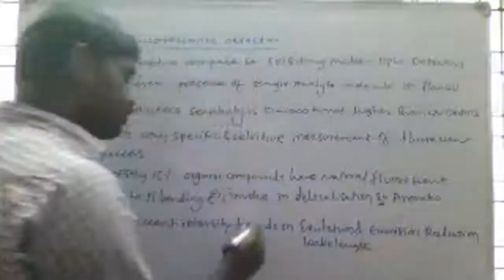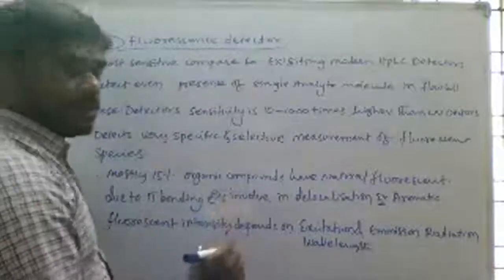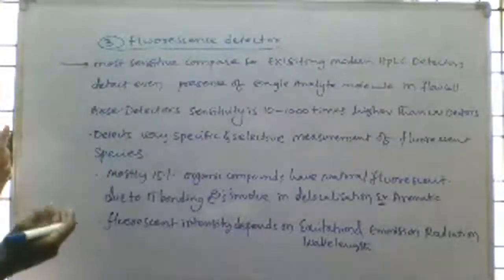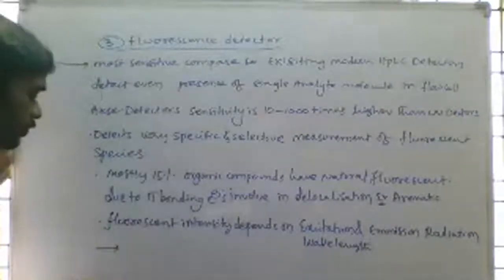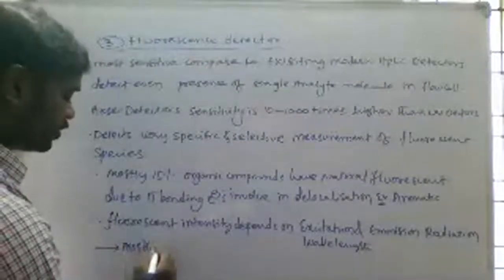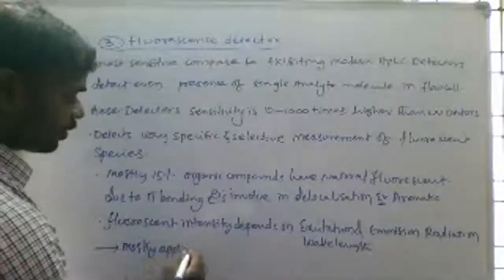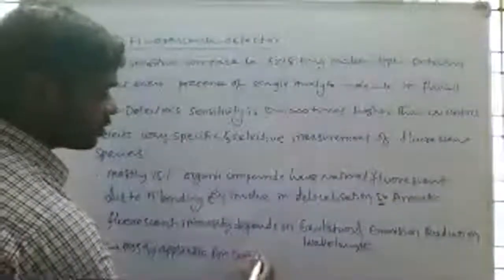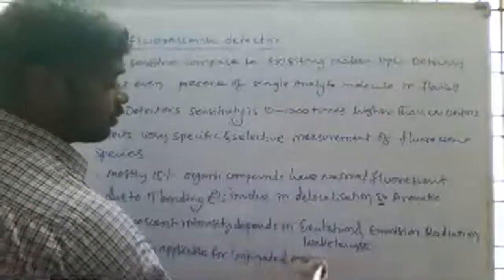The intensity mainly depends on the excitation and emission wavelengths. Its main purpose is that it is mostly applicable for conjugated systems, conjugated molecules.